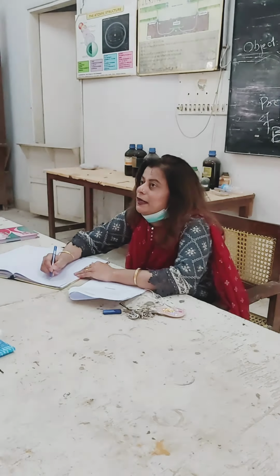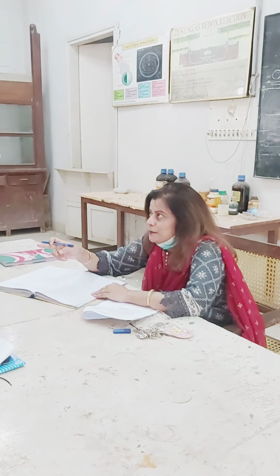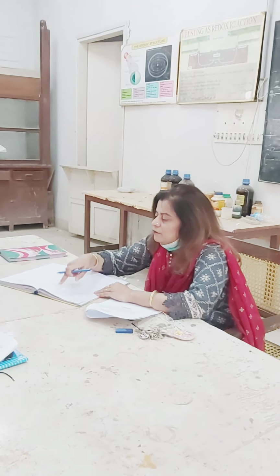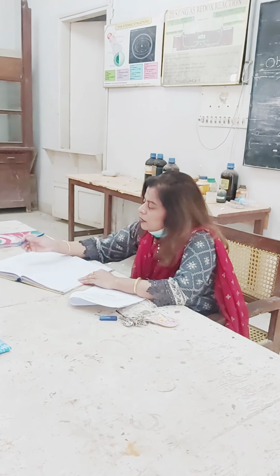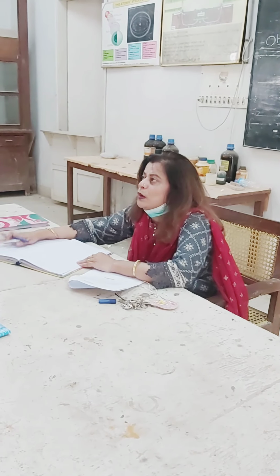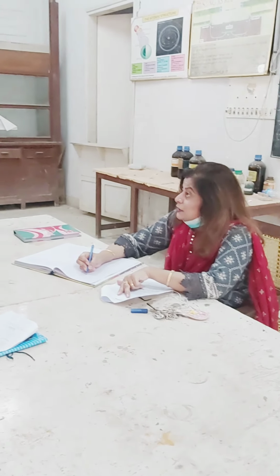I have explained in one of my videos on LMS how a diagram works, and I also shared it yesterday in the WhatsApp group. Check it out. I have shared two videos which are on your LMS also, right? So now this is a nitration. Of course, this is preparation of para-nitroacetanilide. That means it has to do with a nitrating mixture. There are a few terms which you are supposed to know. What is a nitrating mixture? Nitrating mixture.